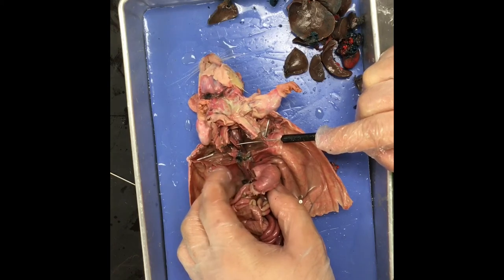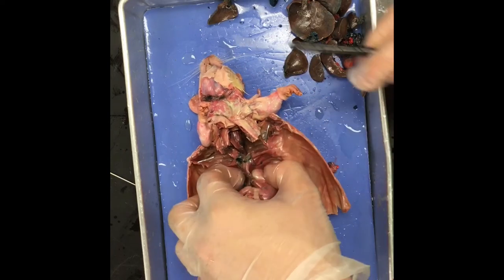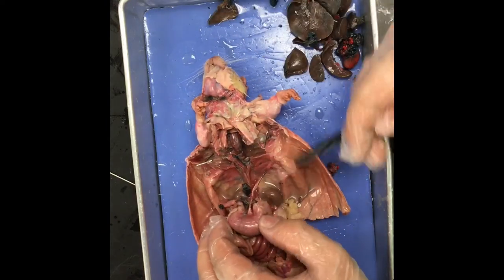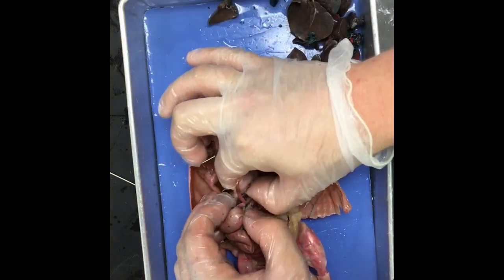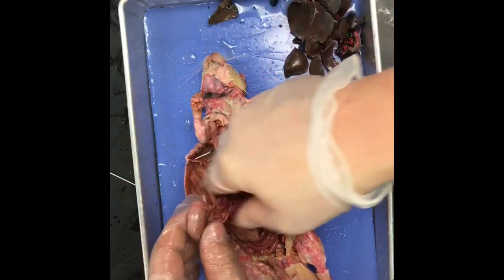That is the esophagus. That's the tube that food travels from the mouth all the way down, connects to the top end of this. And that is what's going to lead to, as you pull it out, the top of the stomach. Which looks like a weird shrimp. It looks like a cherry stem.